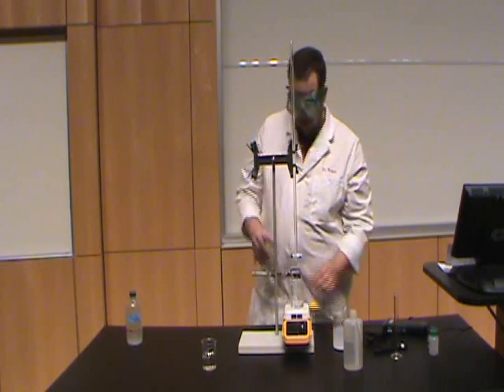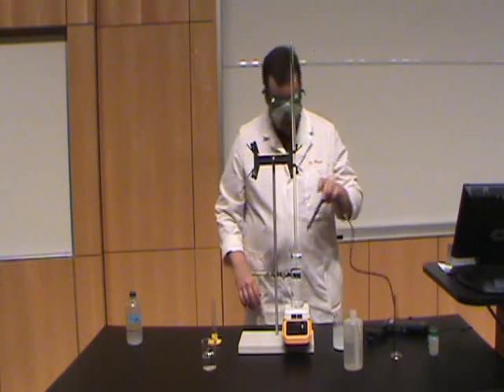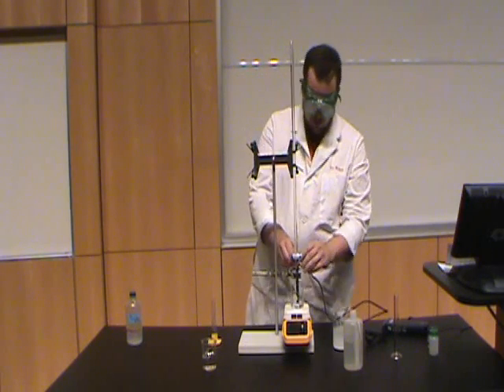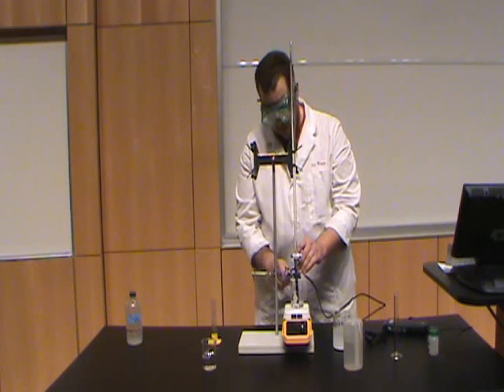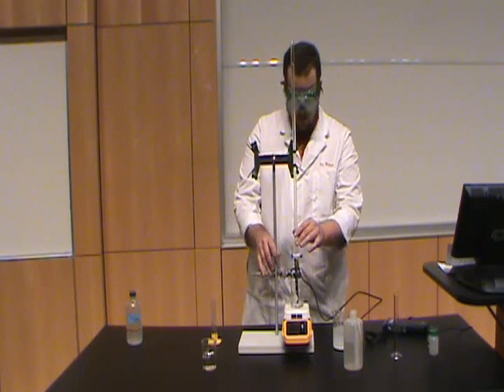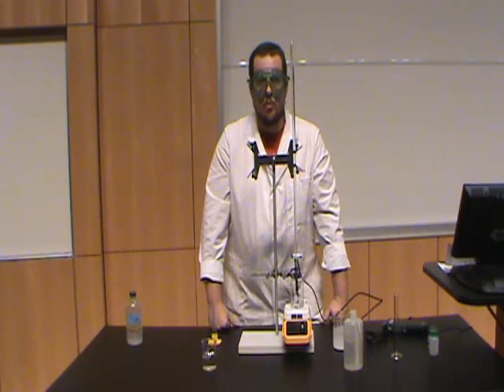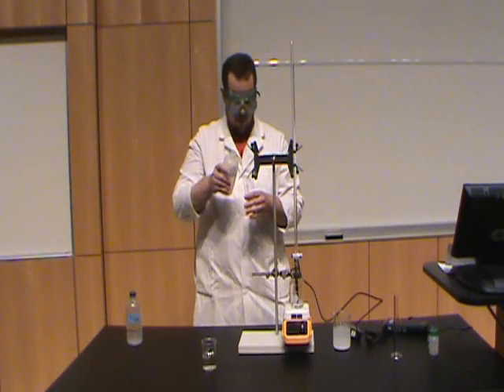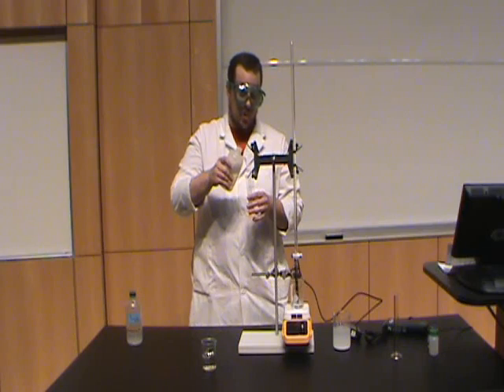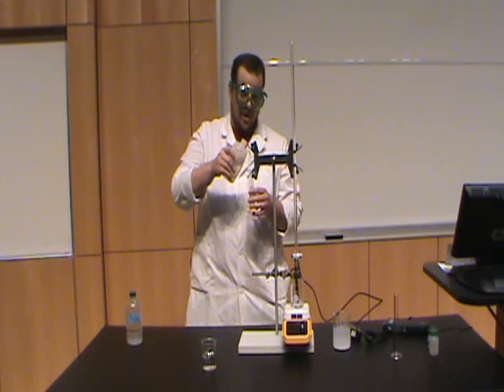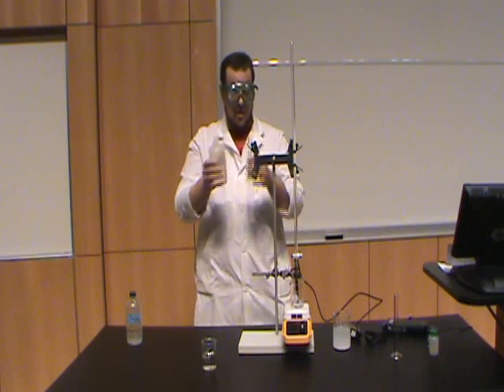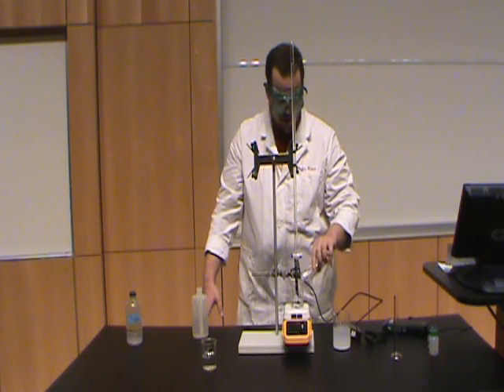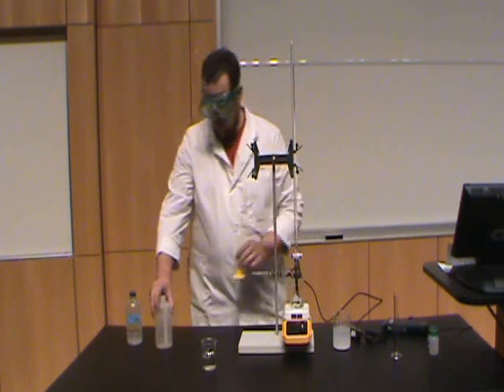And you'll notice a problem here. The problem is that if I try to put my conductivity probe into this solution, the liquid isn't deep enough to cover the tip of the probe. So to help us out with that, we can just get away with adding 25 milliliters of, again, deionized water because we're not going to be adding anything conductive to our experiment. We're just bringing the volume up.